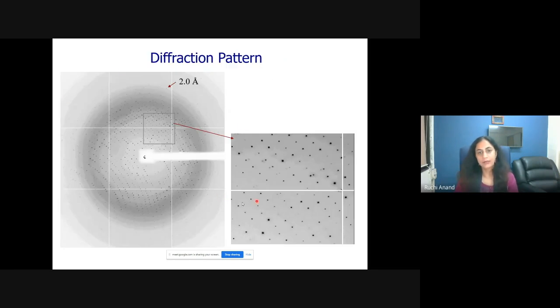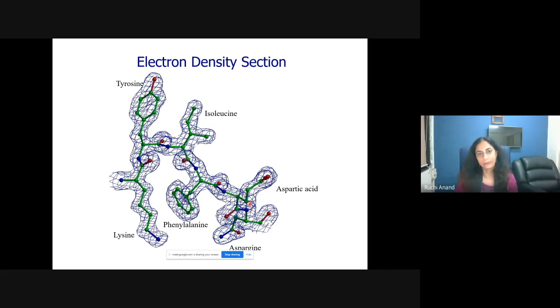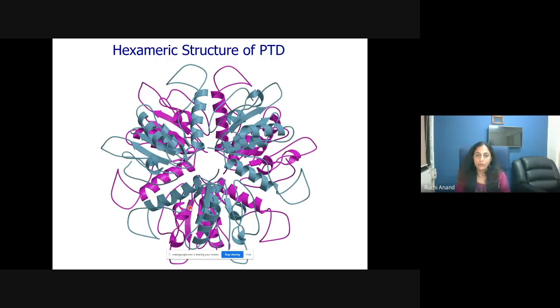From the diffraction pattern, intensities are extracted to get structure factors, and from there you move toward the structure. The electron density is then used to fit amino acids — for example, lysine, tyrosine, isoleucine, phenylalanine — and the whole protein structure is built. Each amino acid has its own side chain clearly visible, and the amide bond is also very clear. For easier viewing, we use a cartoon representation showing the overall secondary structure.